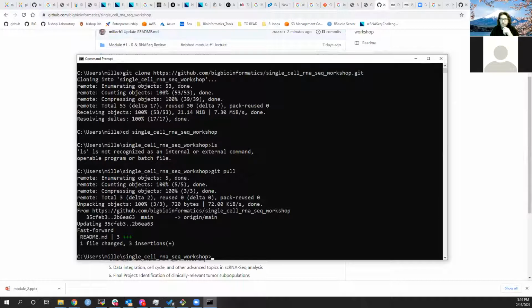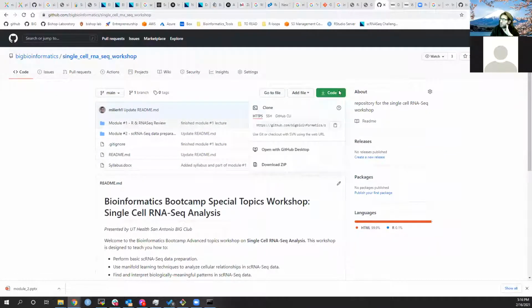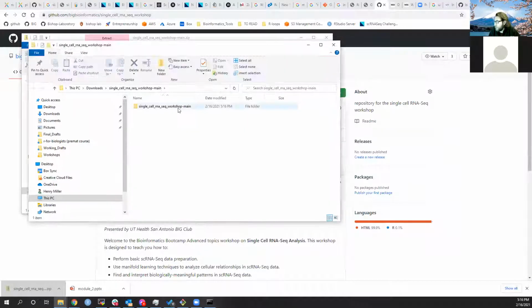Okay. And if you didn't want to do that, or if it wasn't working for one reason or another, you can always come over here and download this as a zip file. And then you'll have the whole thing, all you got to do is unzip it. And there you go. You got the whole thing right here.